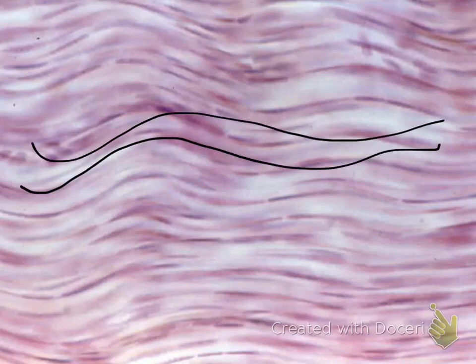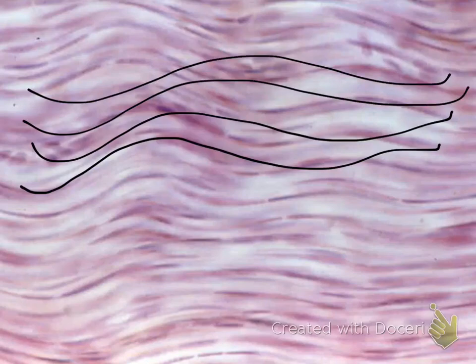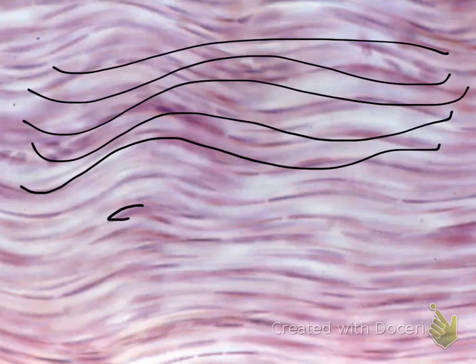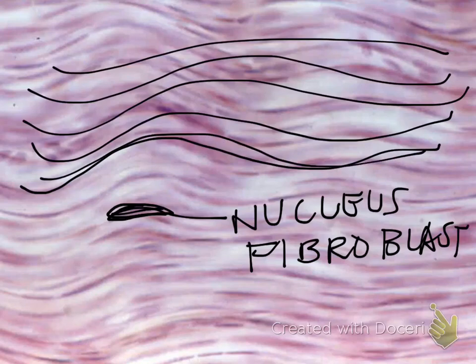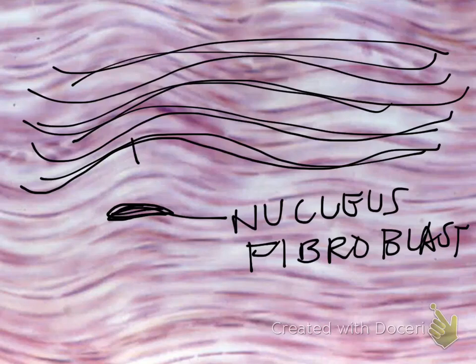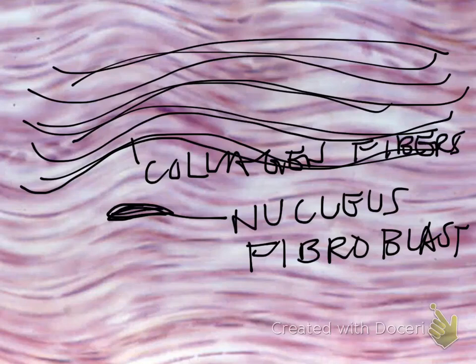In this tissue, you notice that you cannot really see any cells at all. All you see is thick layers of collagen fibers running through it, and they are pretty much all parallel. In these tiny spaces are the nuclei of some cells — the fibroblasts. Fibroblasts are the actual cells that make the fibers. These dark, thick fibers are your collagen fibers. When all you see is collagen fibers and the nuclei of the fibroblasts, then you are looking at dense connective tissue.